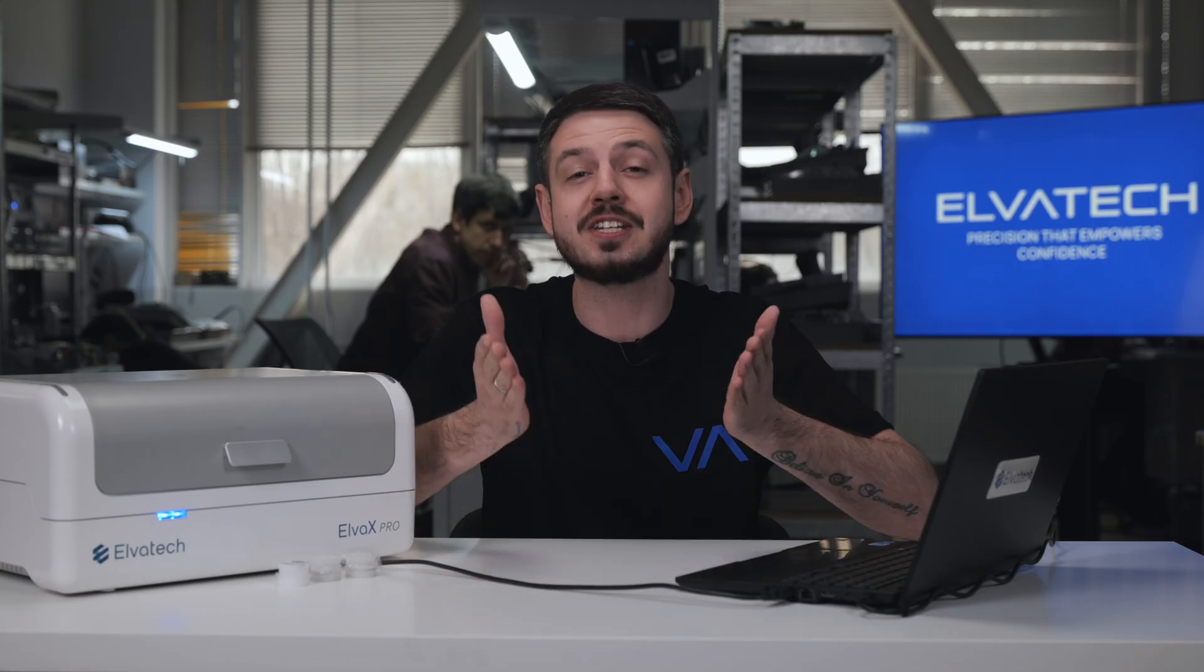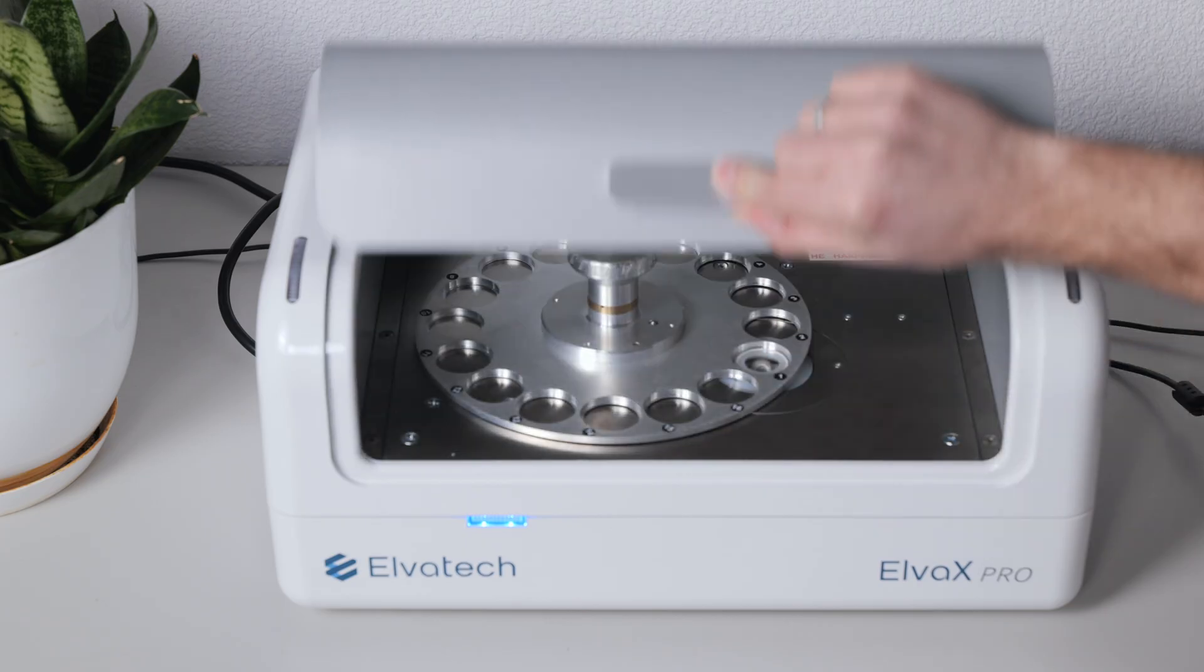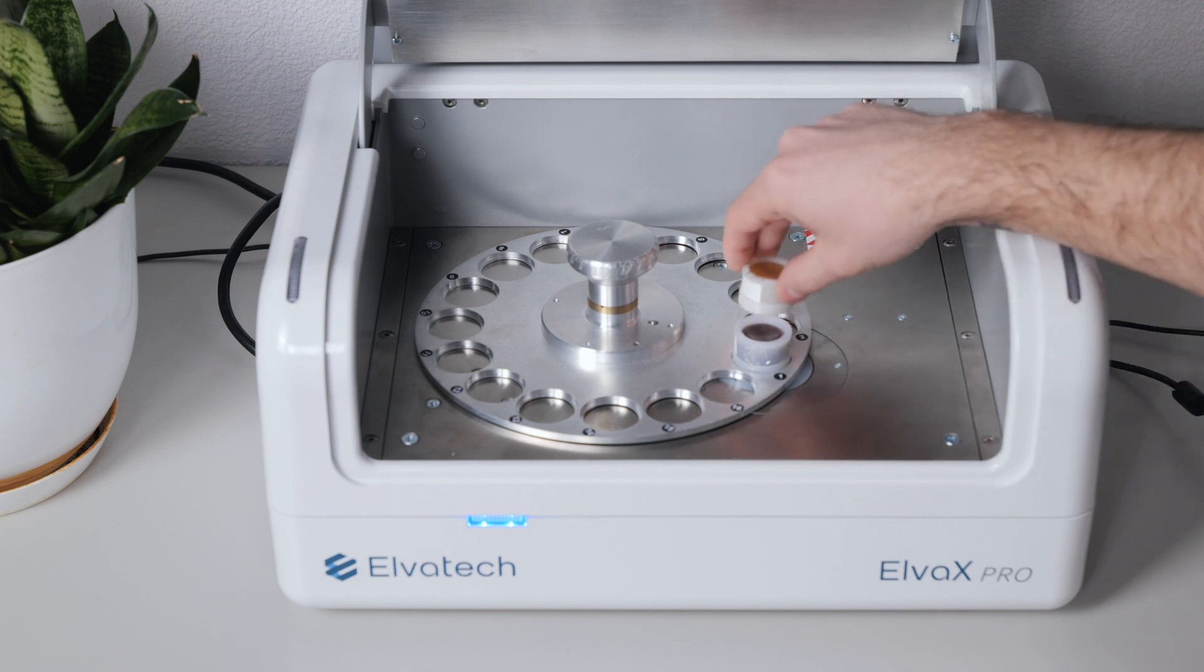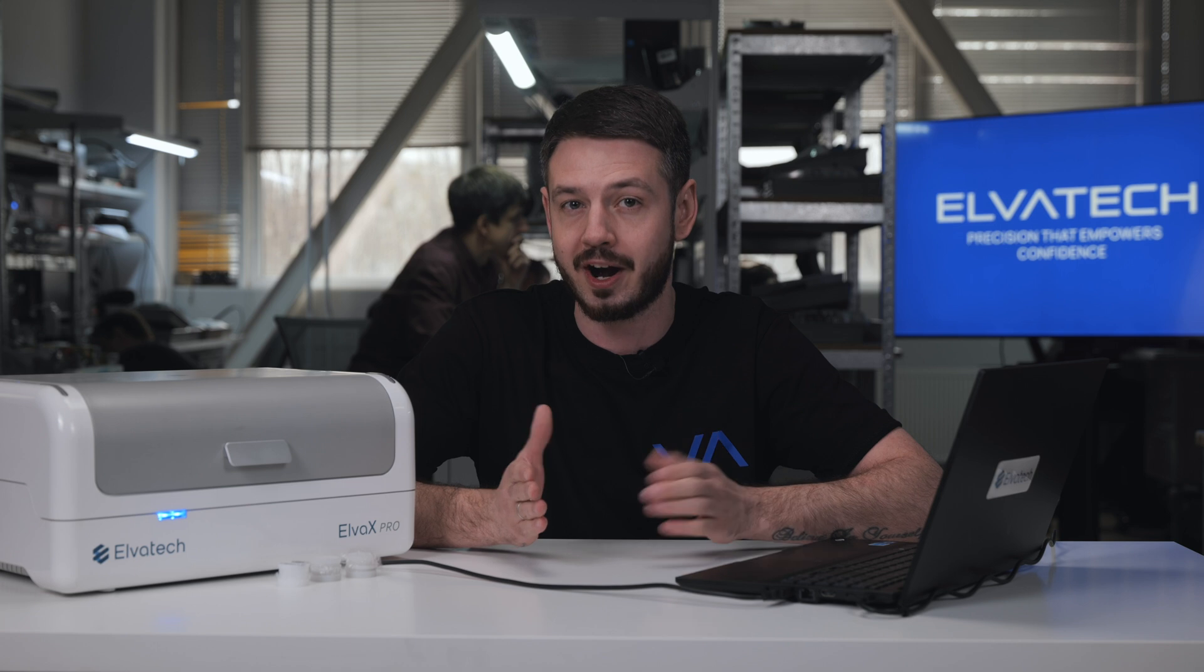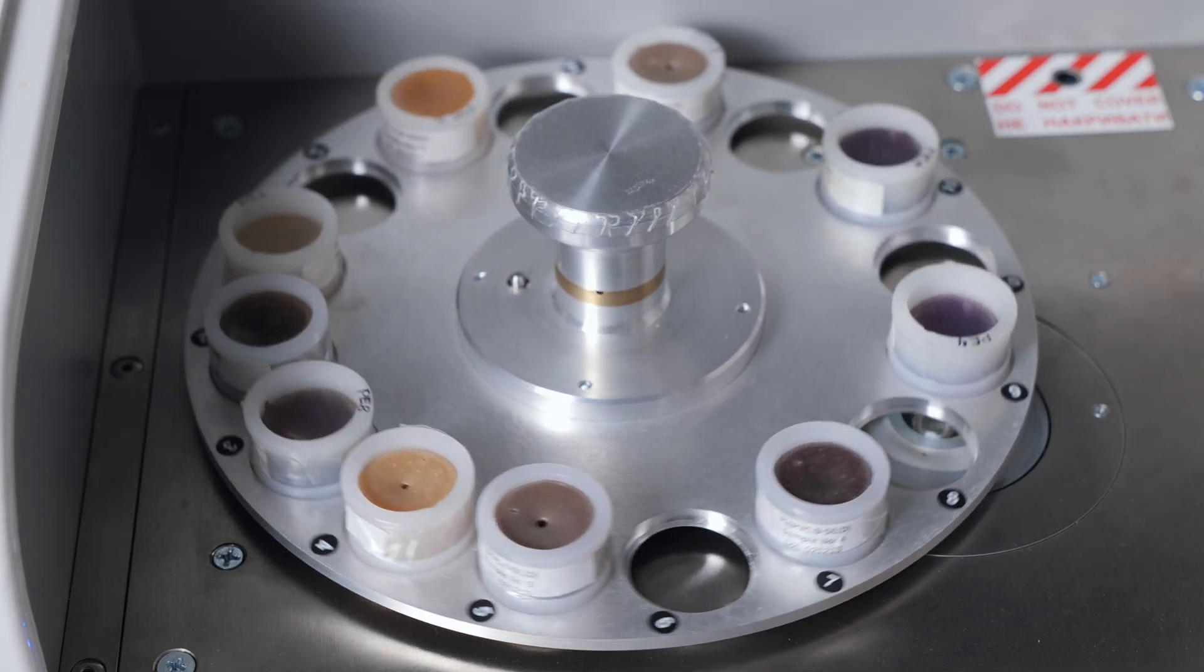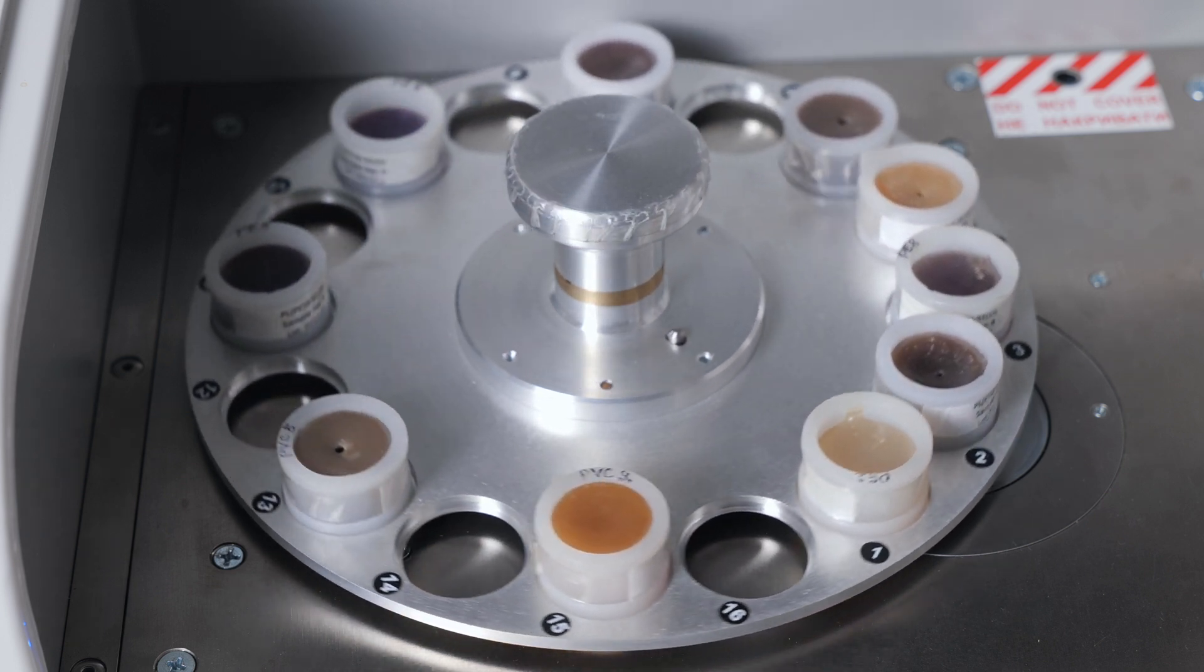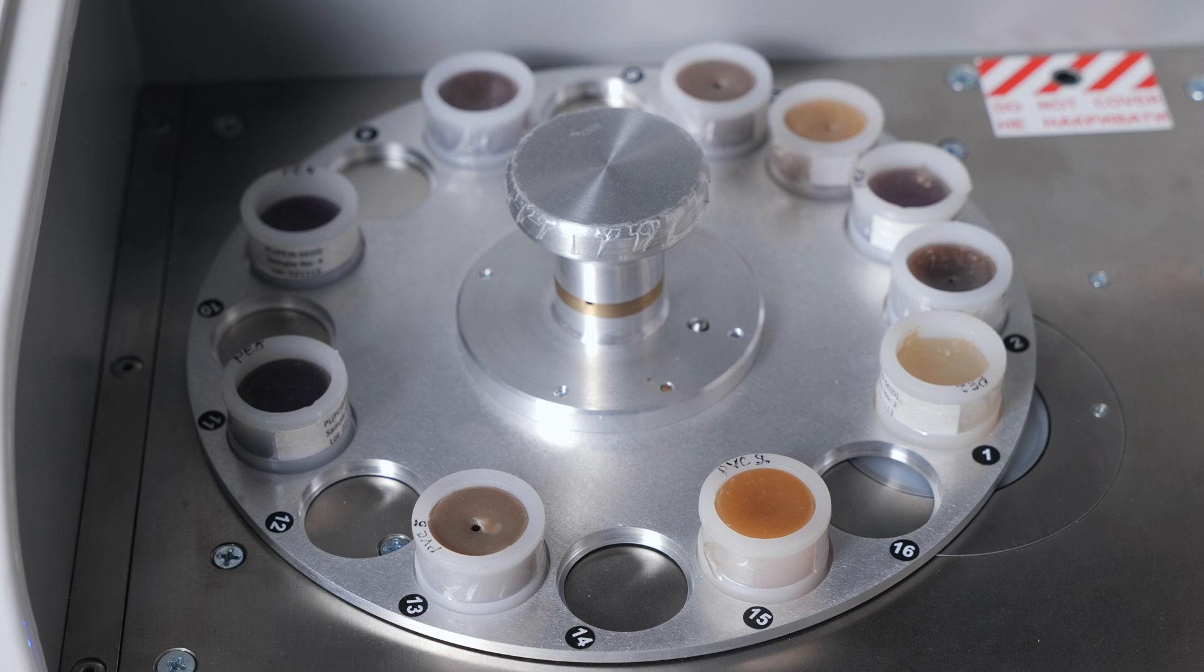Elvox Pro is designed for advanced elemental analysis of solid, powder, and liquid forms of samples. With a powerful 60 kV X-ray tube, an ultra-large 40 mm square SDD detector, and helium purge capability, it delivers extremely low detection limits, even for light elements like sodium, magnesium, and sulfur.